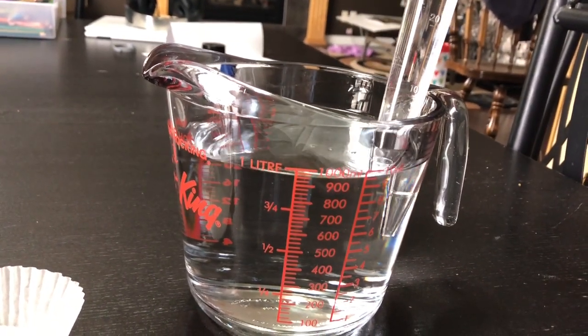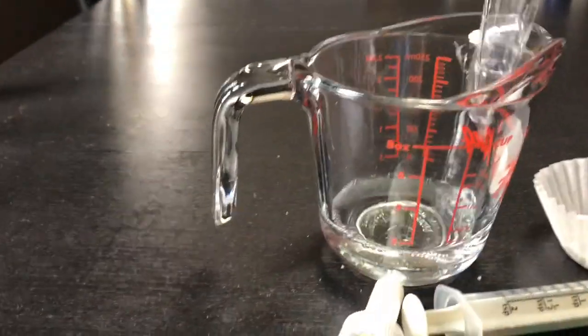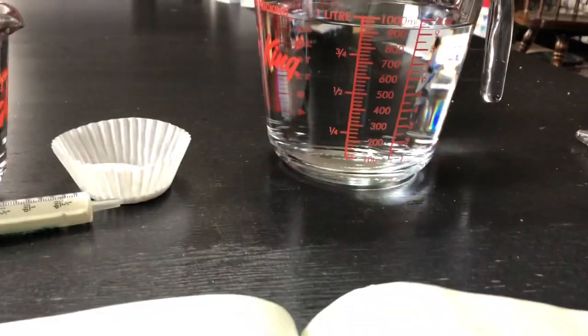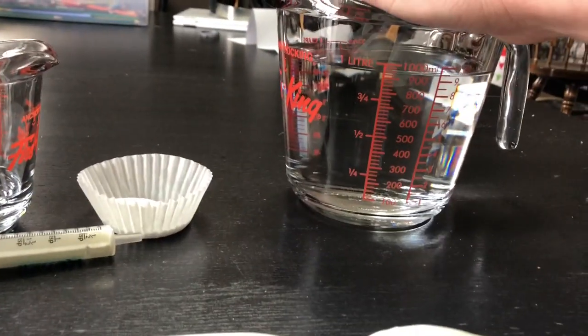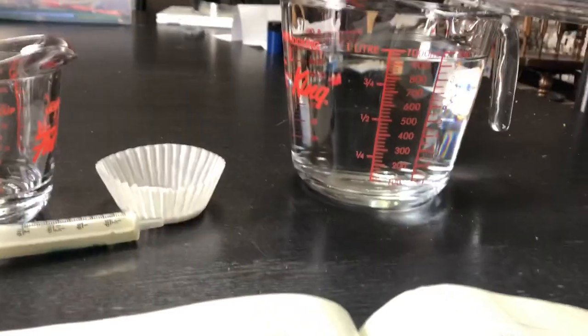Oops, not that good. I'm gonna take that out, and I'm gonna transfer it into here, okay? So I wonder why I did that. Why did I take 30 milliliters out of here and put it all in here? Well, let's figure out by using the next step, okay?